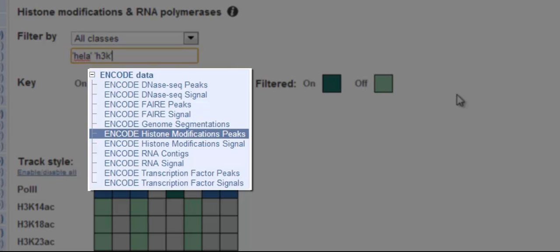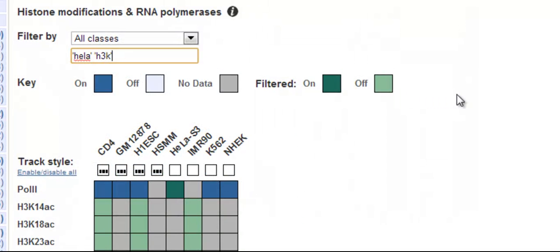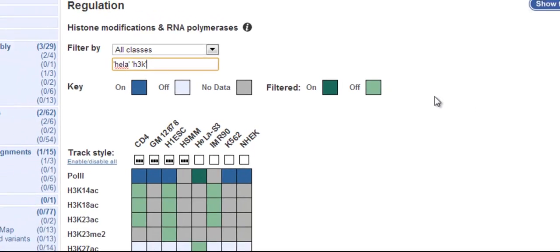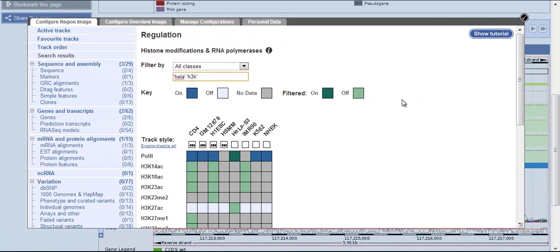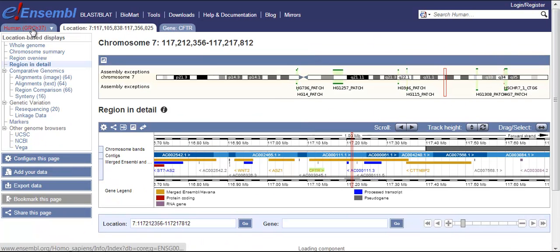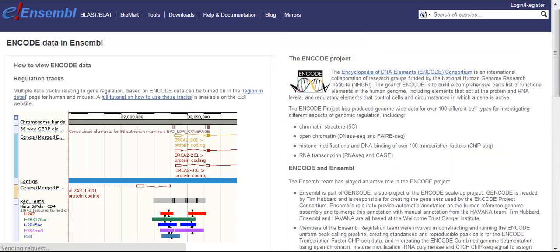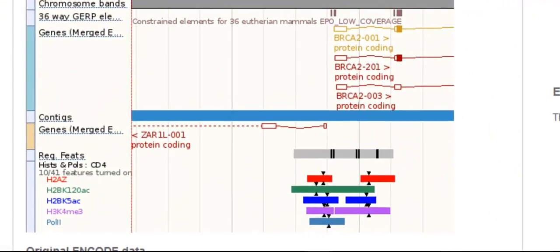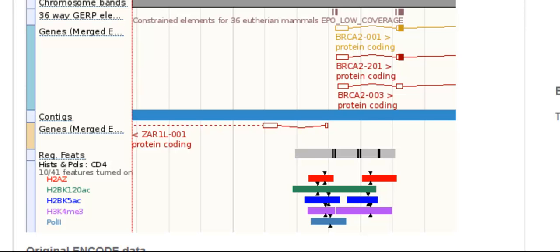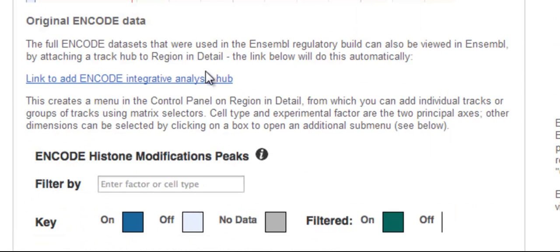Our ENCODE track hub, which allows display of all ENCODE data, works with these same type of matrices. To add the track hub, the easiest way is through the ENCODE page on our website. Go to the home page, click the ENCODE icon, and then follow the link to the track hub.